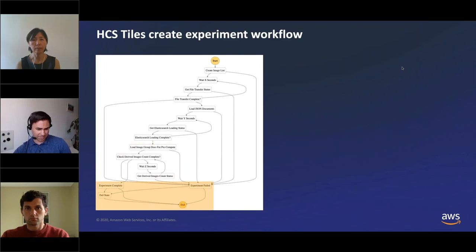And then, Drew mentioned our use of try catch. So obviously, if the experiment failed, we'll report that back to the end user, and if the experiment is complete, we'll also notify via that state change. And that's basically the workflow for when a scientist creates an experiment in the UI, what happens underneath the hood.